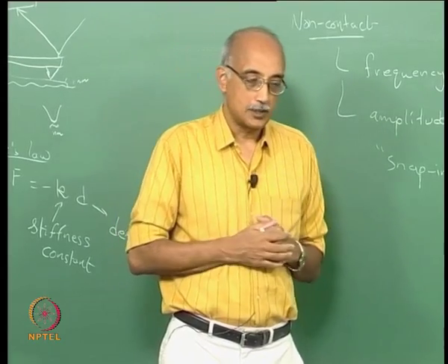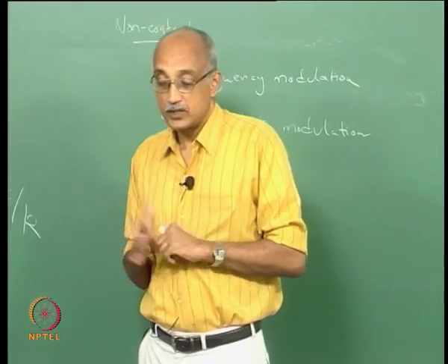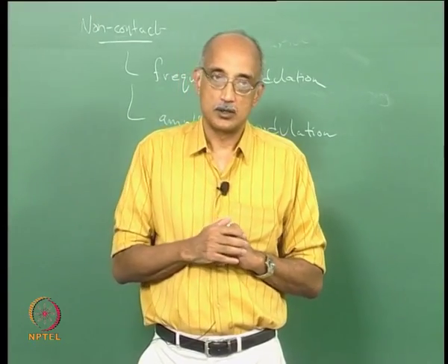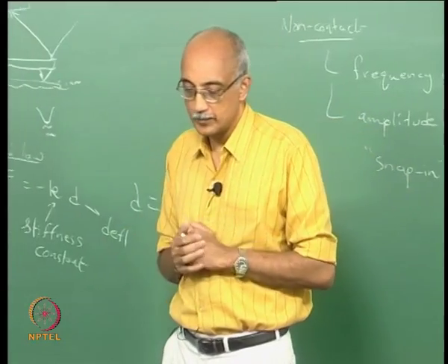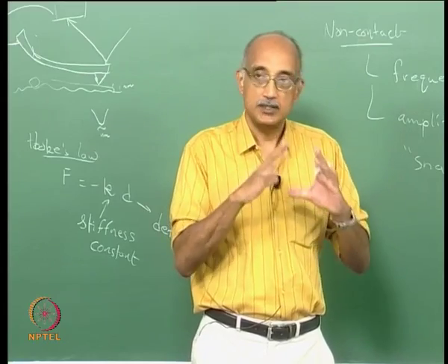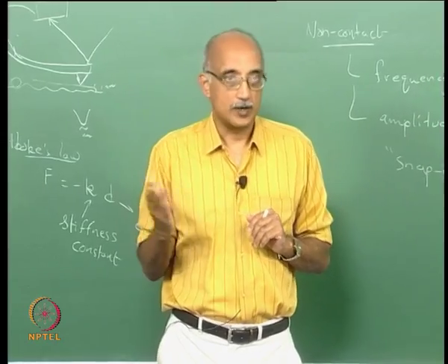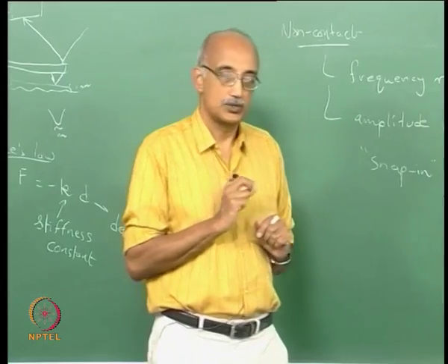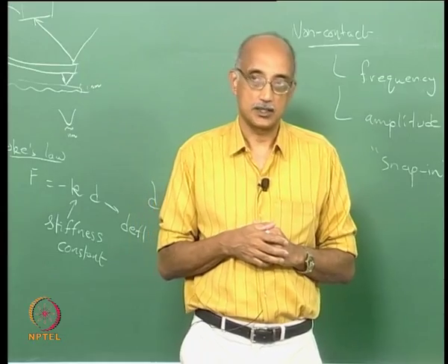Now the other technique that we should briefly touch upon is X-ray diffraction. And by the way, there are entire textbooks on both these techniques, AFM and XRD. So if you are interested or you have a need to use these in your research, you should read them. There are also courses that are being offered in these subjects. I mean, there is a full 40 lecture course on AFM and on XRD. So if you really want to get into these techniques in depth, you should spend a lot more time studying them. I am just giving you kind of an overview of these techniques in this lecture.